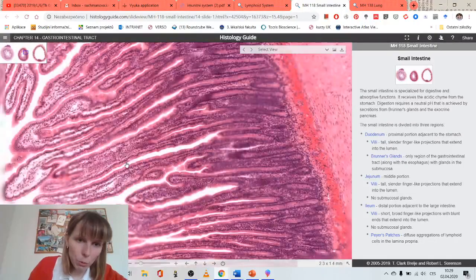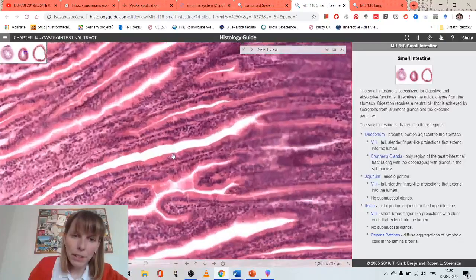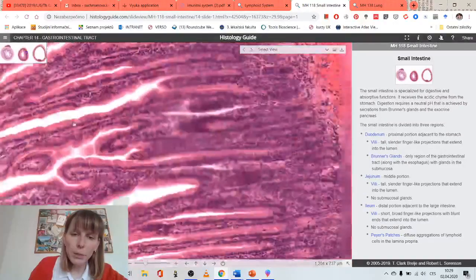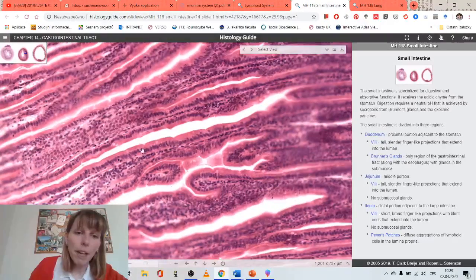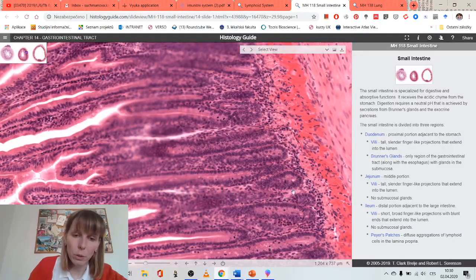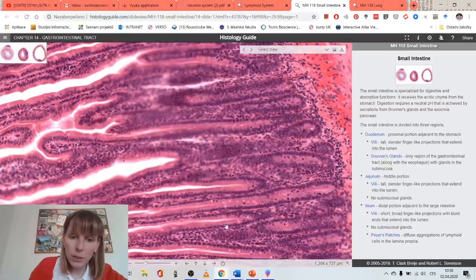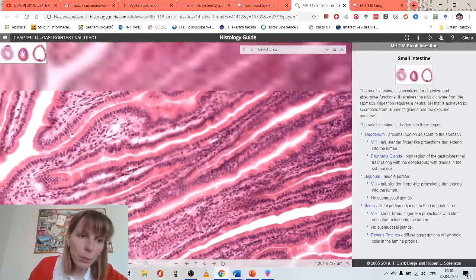you should be able to find the epithelium. This is the columnar epithelium lining the villi and going inside the crypts as well. How to recognize the difference between the villi and the crypts is that the villi have empty space between them, but the crypts just have connective tissue around them, no more empty spaces. So this is where the villus would end, and here is where you would have the crypts. Lamina epithelialis are all these cells sitting on the basement membrane, and some of them will be goblet cells.